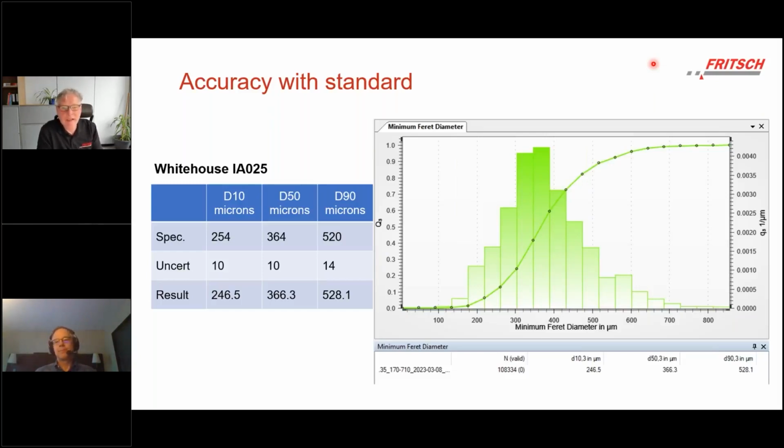Because what you see really, and that's the nice thing with this technology, is the images, you can look at them. These are very high quality lenses that we are using, so-called telecentric lenses, that give you very nearly distortion-free images, not completely of course.